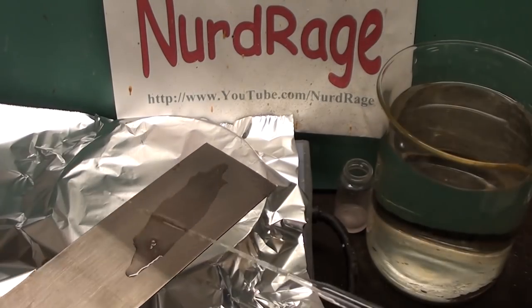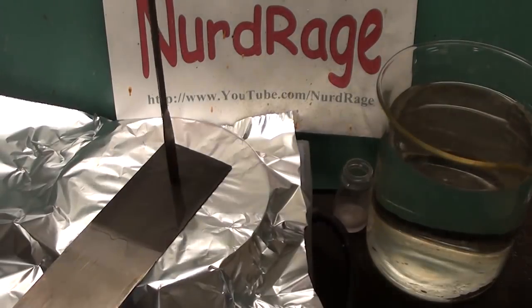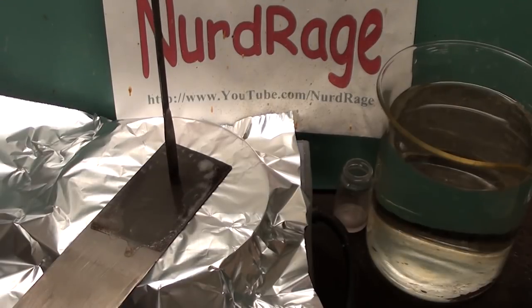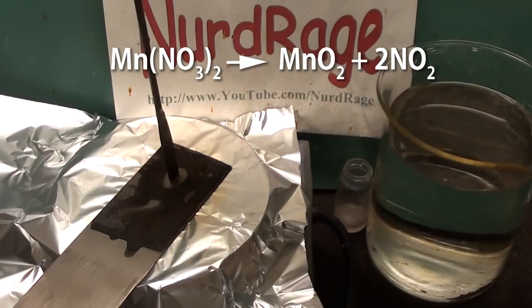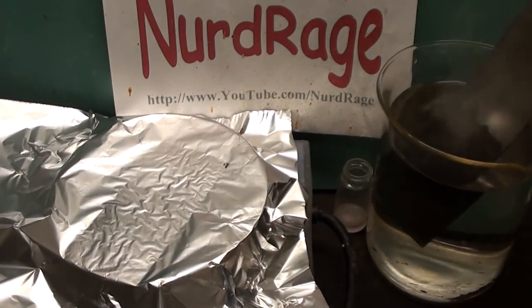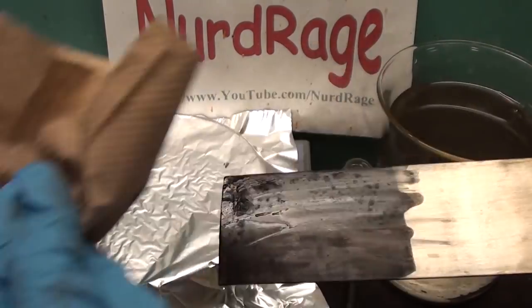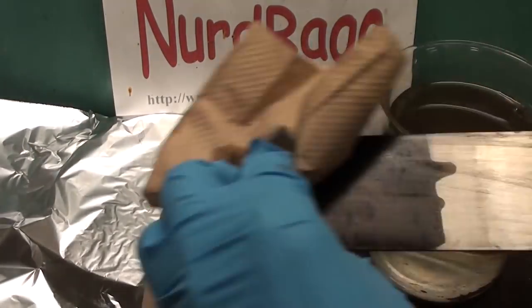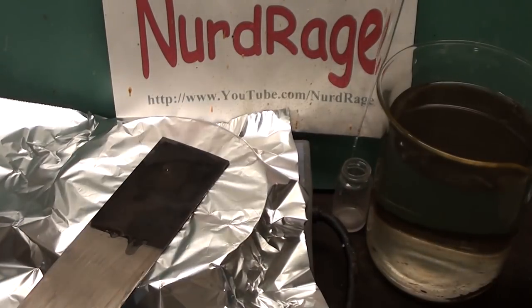Apply a layer of manganese nitrate solution to the titanium and then place the titanium on the hot plate set to at least 300°C. Press down with a rod or spatula and as the electrode heats up the manganese nitrate will decompose into manganese dioxide and release nitrogen dioxide. When the electrode stops belching out brown nitrogen dioxide, immerse the electrode in water and wipe away any loosely bound manganese dioxide. Then apply another layer of manganese nitrate and repeat the process as many times as necessary.